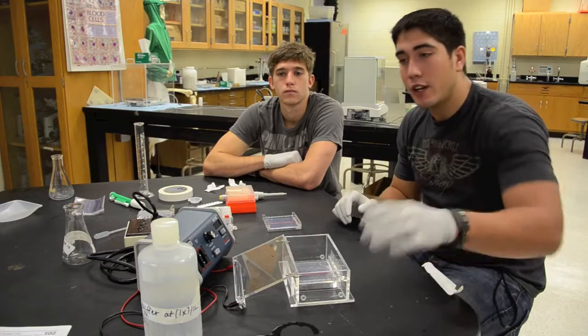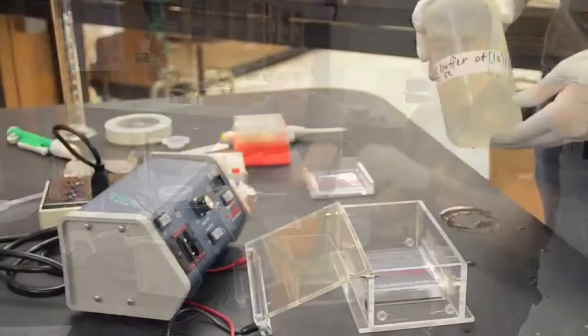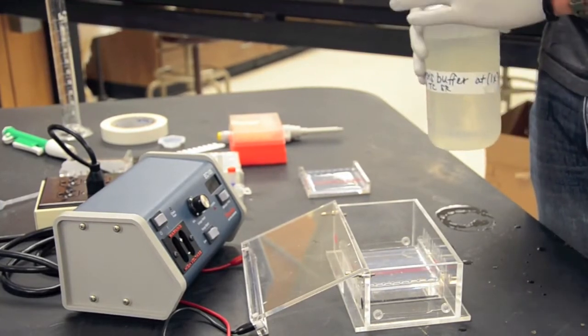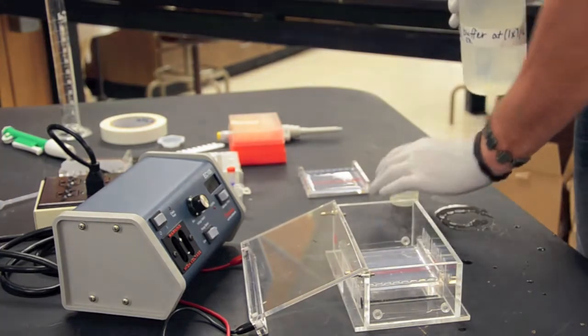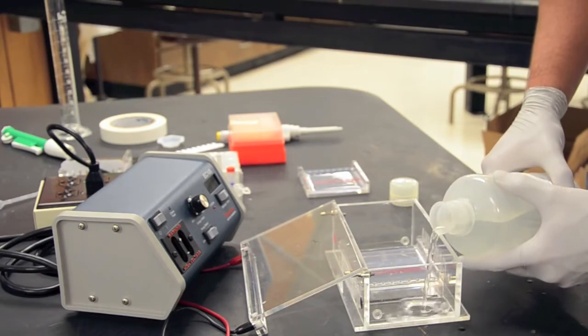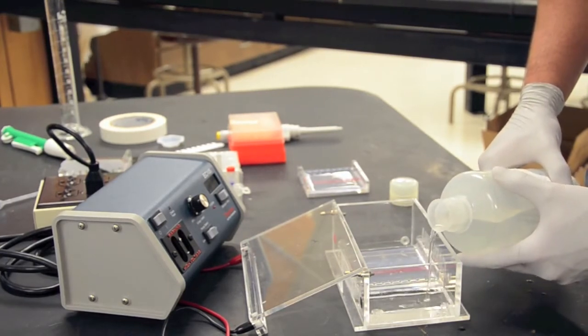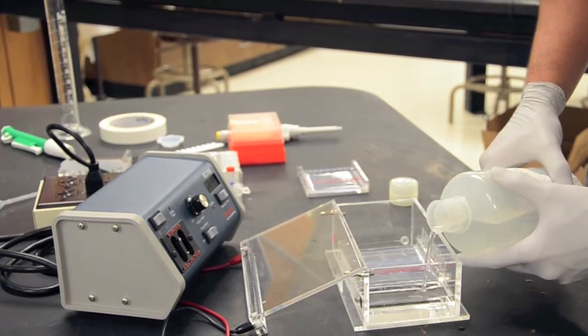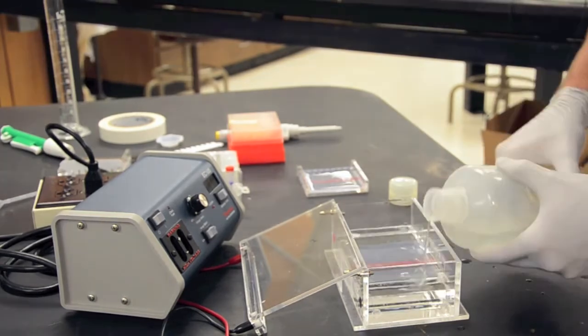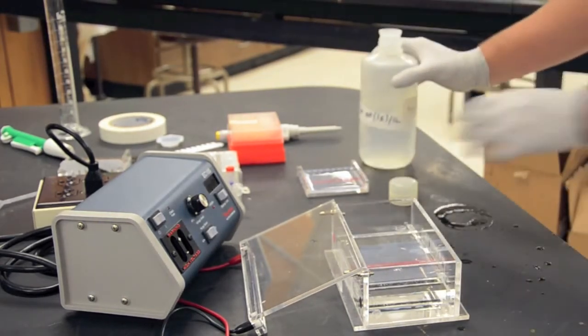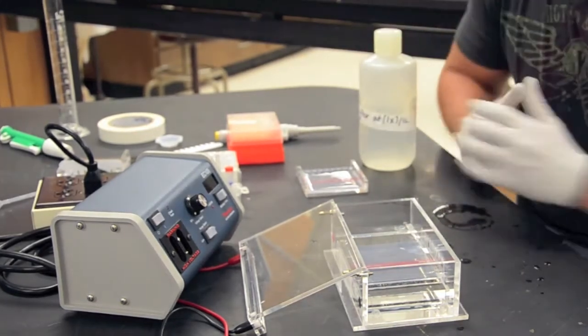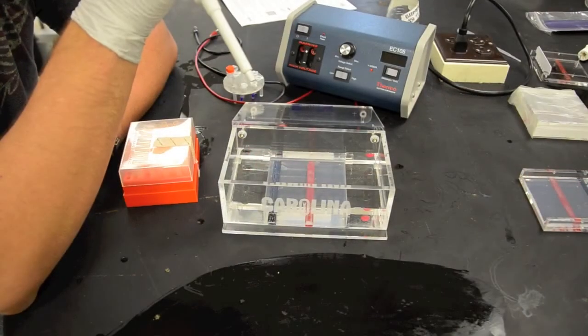Now your next step is going to be to load your buffer onto your bed. Okay so we have our buffer now and we are ready to load it into the chamber. Make sure the lid is down keeping with the sterile technique and we're just slowly and carefully going to add our buffer until it reaches the top notch of this gel bed making sure it covers the actual agarose gel as well.